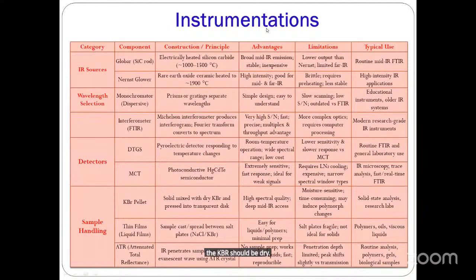Whenever we are analyzing the sample and this KBR is not dry, it is having moisture, then that will interfere in the analysis. I will show you this in the spectrum.